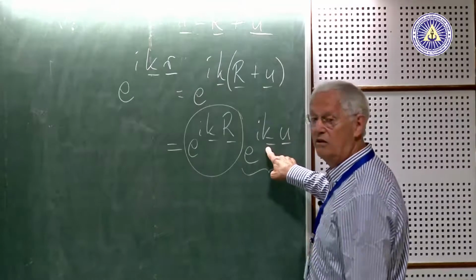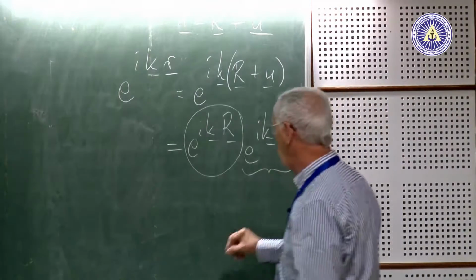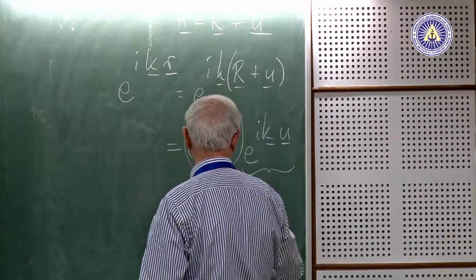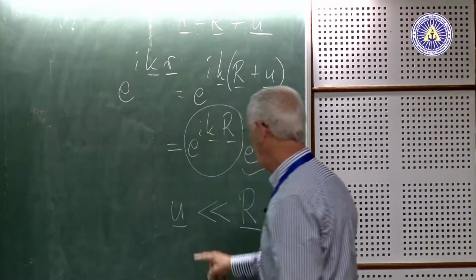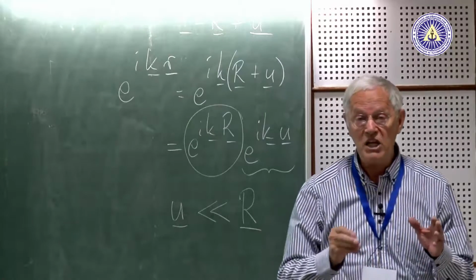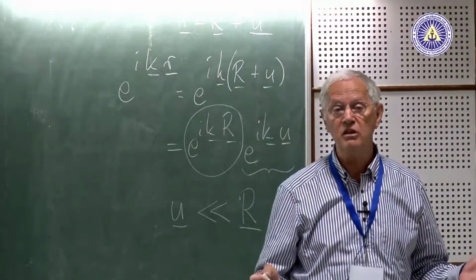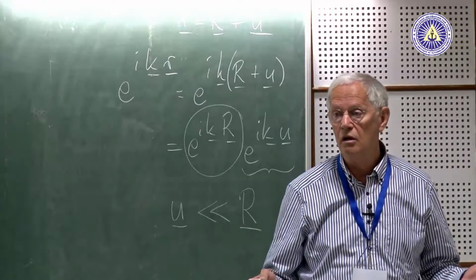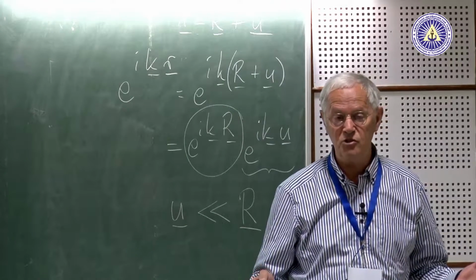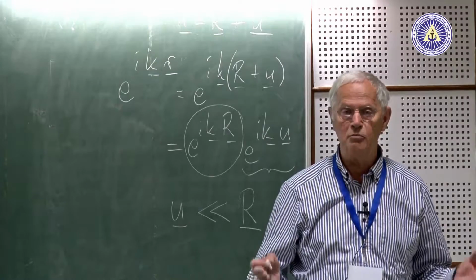When u is small, smaller than r. Okay? The displacement cannot be large, because if the displacement would be large, and especially random, what would the crystal be? Amorphous. We are not caring about amorphous materials when we do line profile analysis. We should, but that is more complicated.